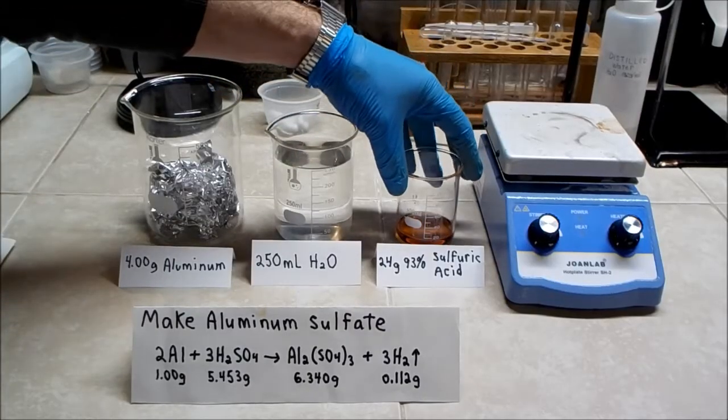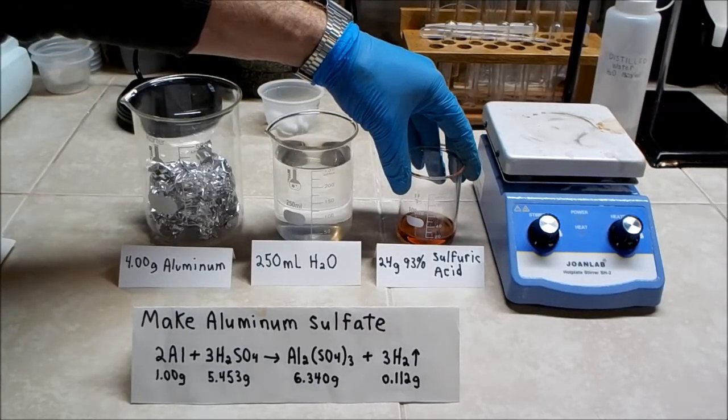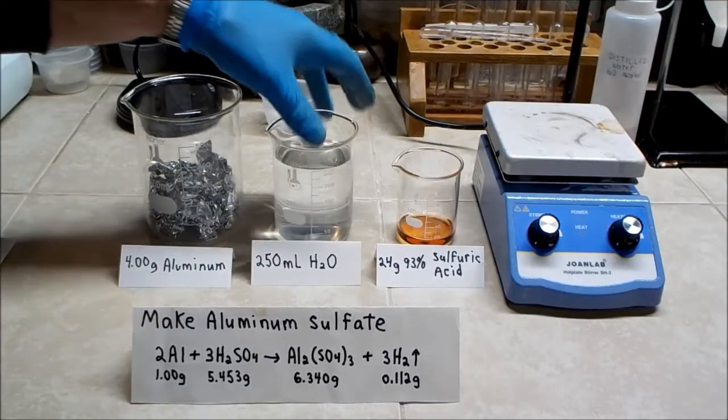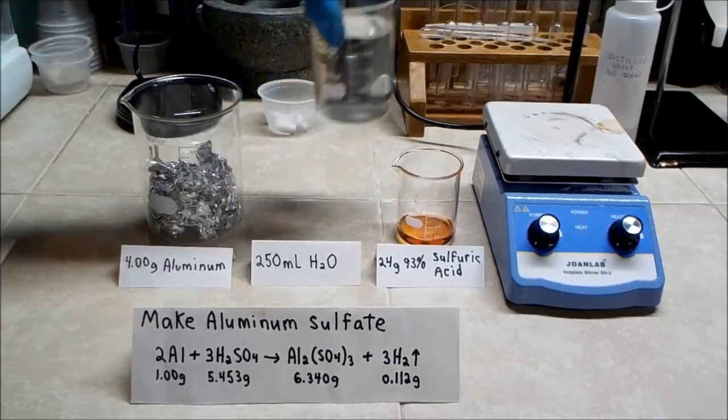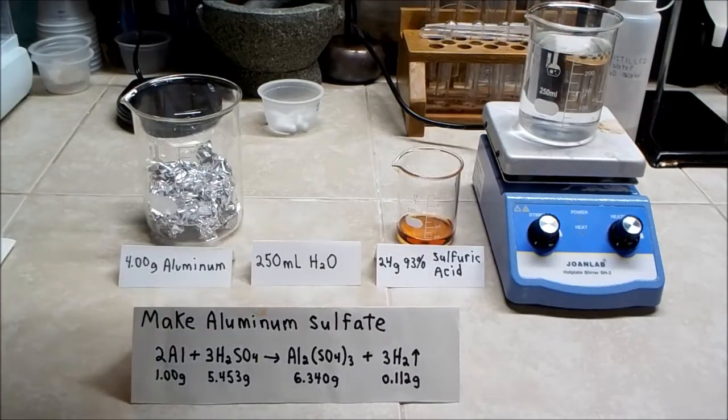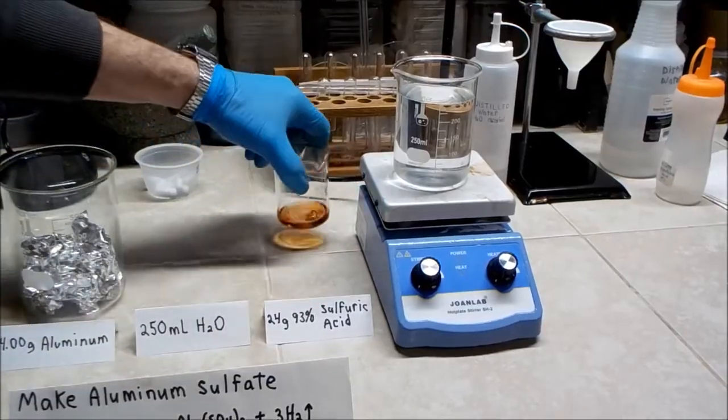4 grams of aluminum foil, 250 milliliters of water, and 24 grams of 93% sulfuric acid. The acid is a little bit in excess — I will explain why later. So the first thing we do is add the acid to the water.